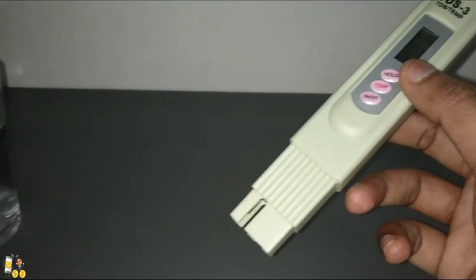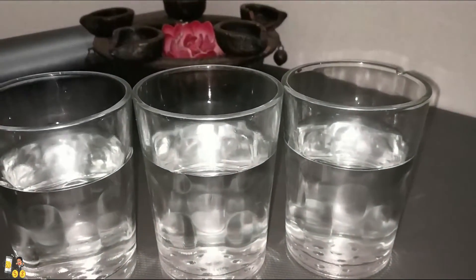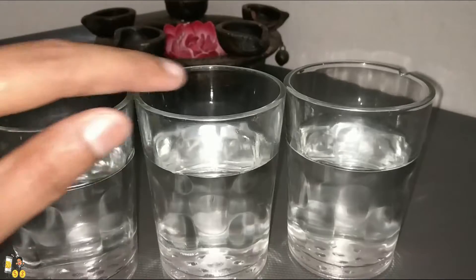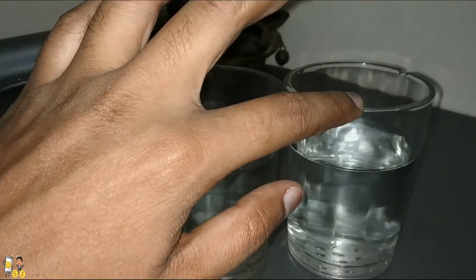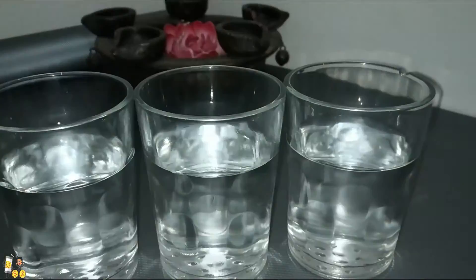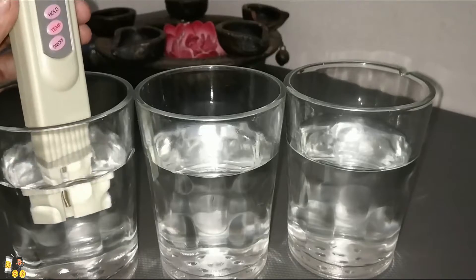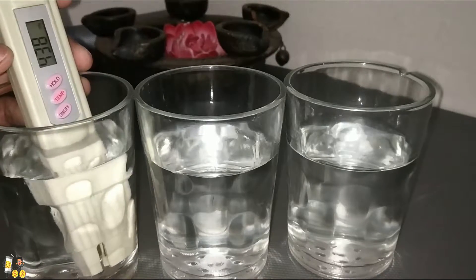Now let's check the water samples. Here we have three glasses: this is the tank water, this is the bore water, and this is the filtered water which is RO and UF. We are going to place the TDS meter in the tank water first.